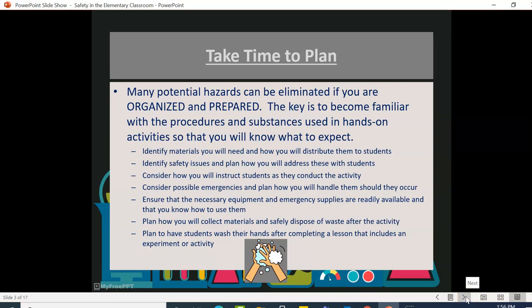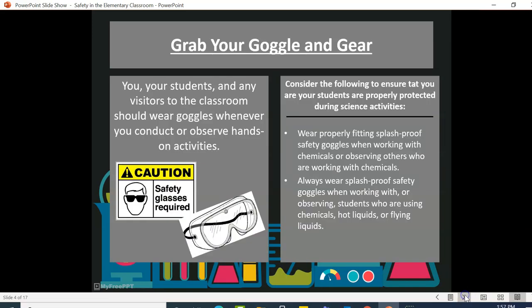If you would like to use or combine chemicals on your own, find out whether or not the activity you are planning is safe to perform in a classroom setting. Consult a high school science teacher, your science supervisor, or a science professional to learn about any potential problems.